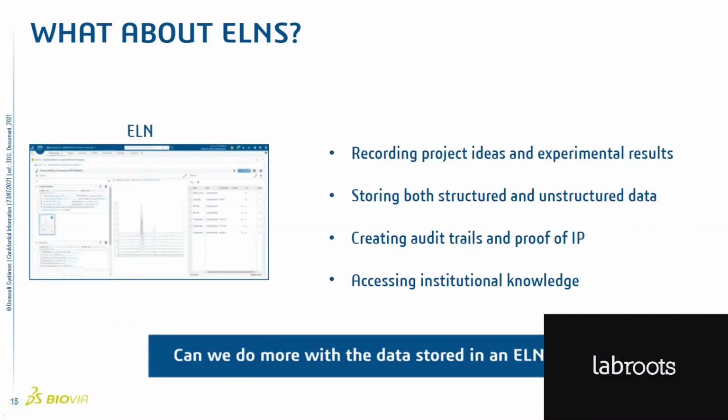So that's all well and good, but how can we apply that to lab informatics solutions? So if we look at an ELN, let's think about what we use it for. We're using it as you create and perform an experiment. So you're writing down the project ideas and then the experimental results there. Any of the data that you get out of it, whether it's structured or unstructured, that's getting stored in the ELN as well. You need to create the audit trails, and so you're creating proof of the IP there, and you're using it to search and access other knowledge across the organization as well.